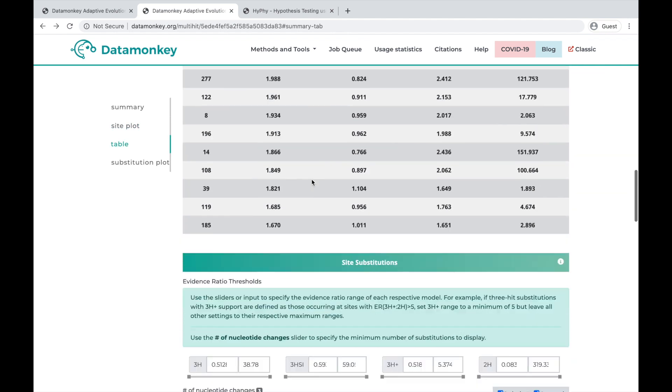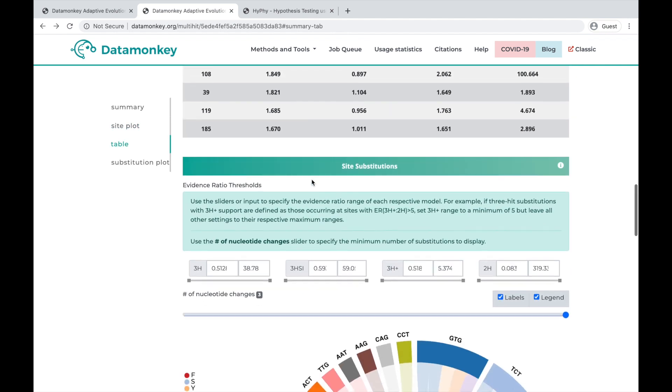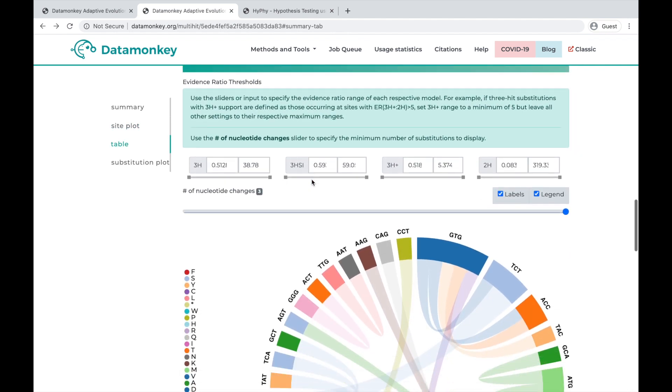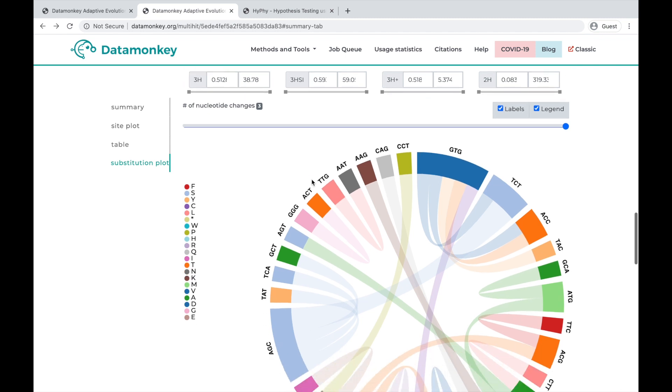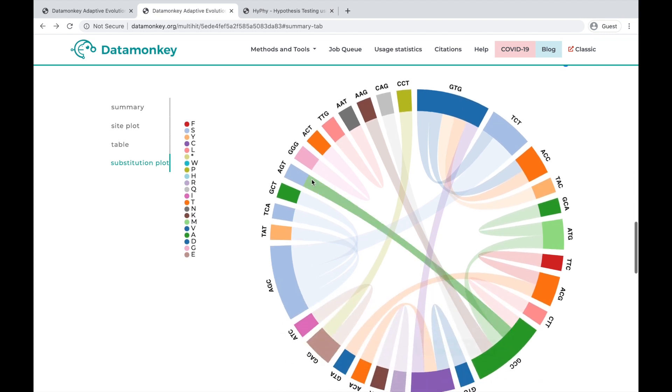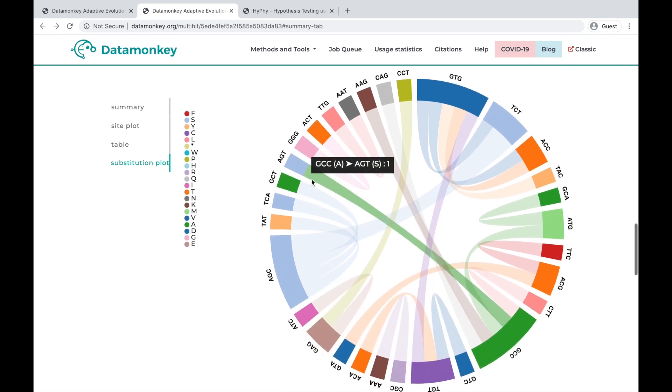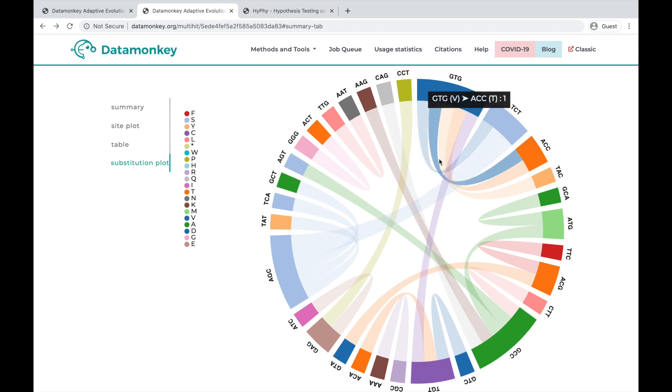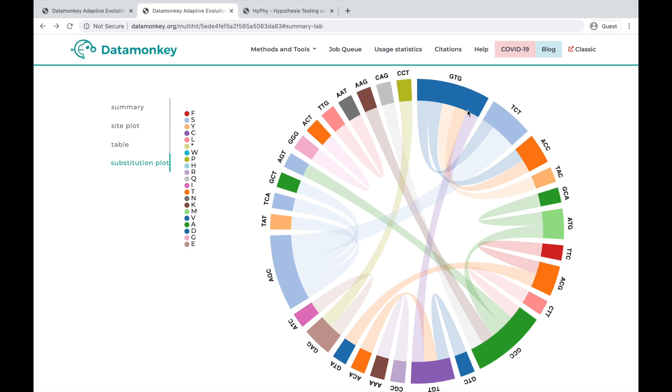So then if we continue scrolling down, we can see this circles plot for site substitutions. Basically here, this is showing the flow of substitutions from one codon to another.